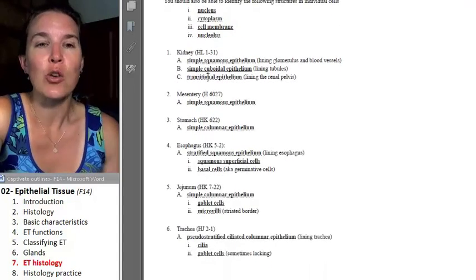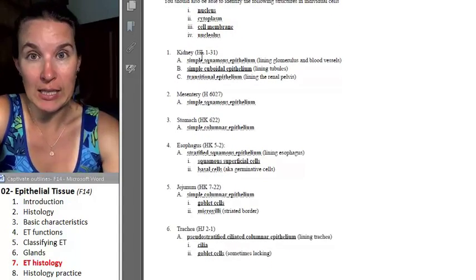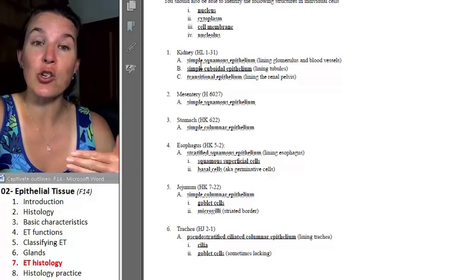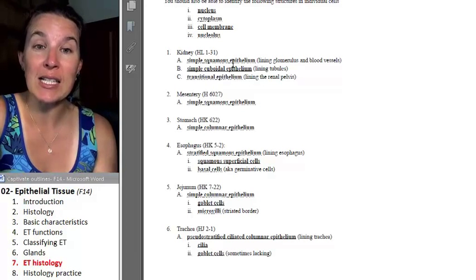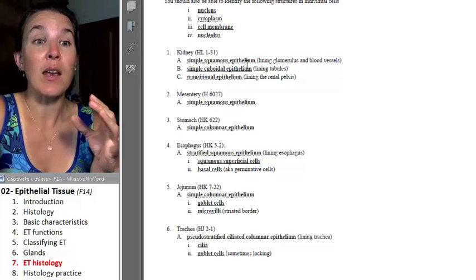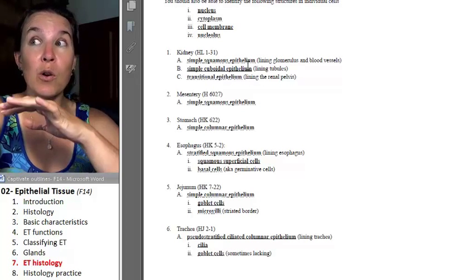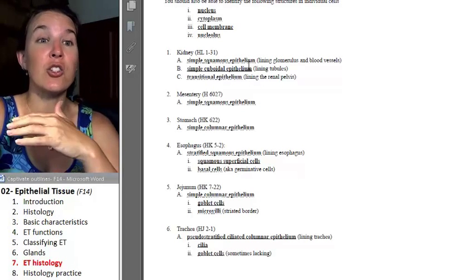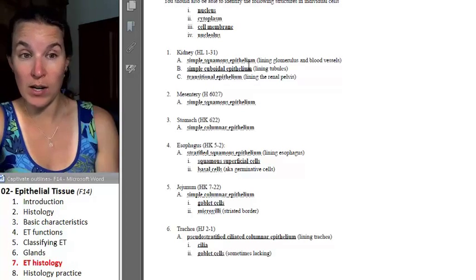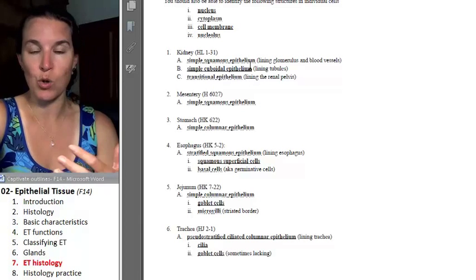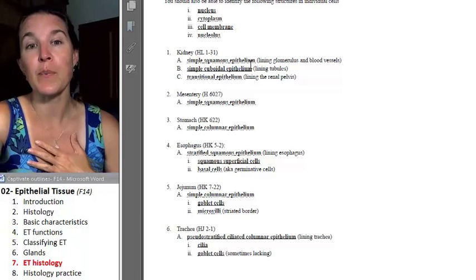For example, you have a kidney slide, and in the kidney slide you're going to find an example of simple squamous epithelium. We're going to work together as to where this is — we'll do walkthroughs and we'll quiz each other.